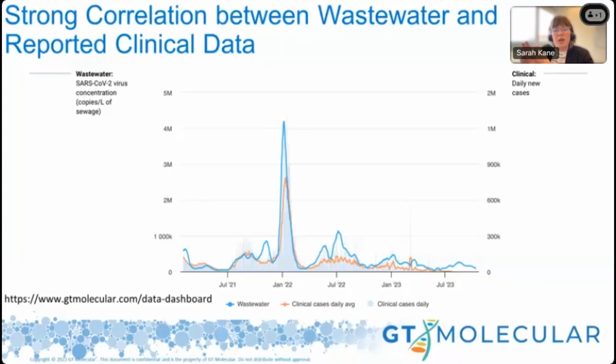So we found, and we have a nice app note I can send to you, that essentially shows that what you can do is take an influent sample, pellet it at 3,000 times g for 30 minutes, and then bead beat the pellet. And that has amazing C. auris recovery. So it's actually a pretty simple and straightforward workflow that I wish I would have thought of myself. But yeah, huge thanks to the collaborators in Nevada who steered me in that direction. So again, happy to share the app note with you if you would like.